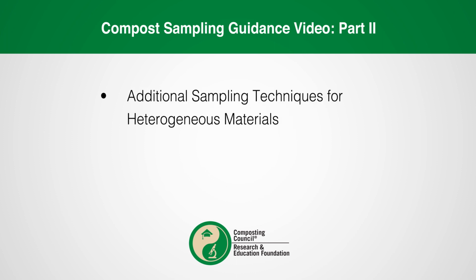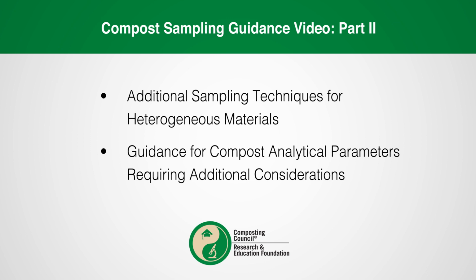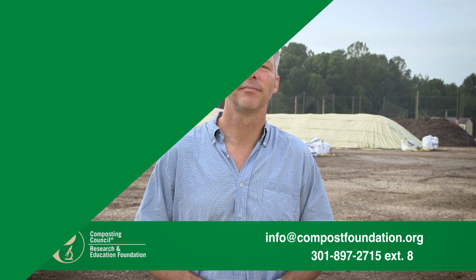Additional sampling techniques for heterogeneous materials. Guidance for compost analytical parameters requiring additional considerations. Please be sure to watch the entire video before developing a sampling plan and initiating the sampling process. Additional sampling guidance is available from the CCREF.